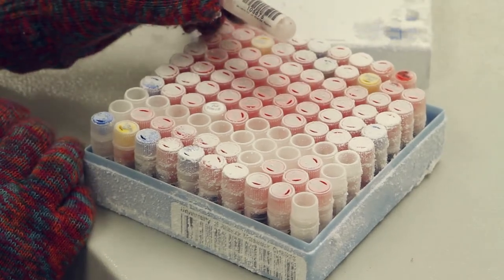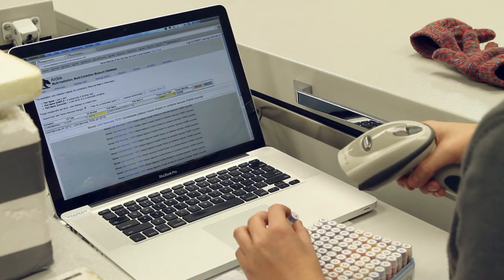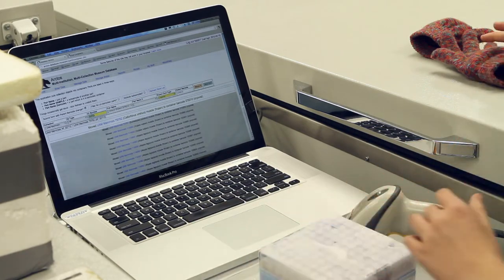If you put it in the minus 80, you slow that process down, but the enzymes are still breaking down the DNA, but at a slower pace. By putting it in liquid nitrogen tanks, it stops it pretty much completely.